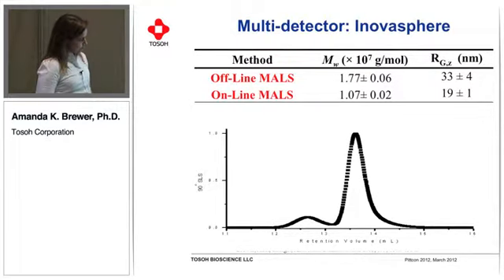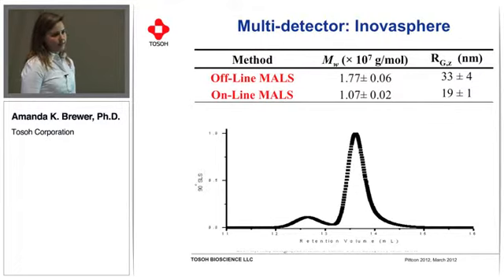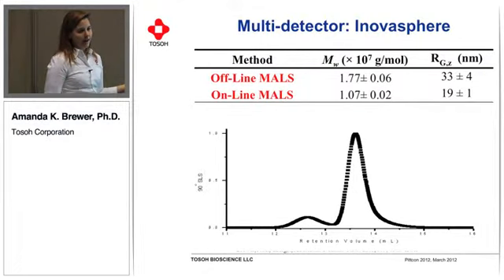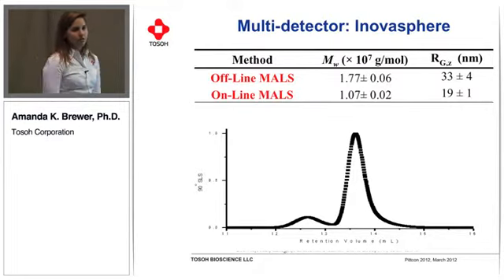So I have the retention volume on the x-axis. I should say this is all at 1 mL/min, so the volume and if it was retention time would be the same. And this is the 90-degree light scattering detector. This is just the photodiode at that angle for the detector. And so we've plotted the chromatogram. So this is what's occurring, and we came up, there's 2 peaks. We were expecting one thing.